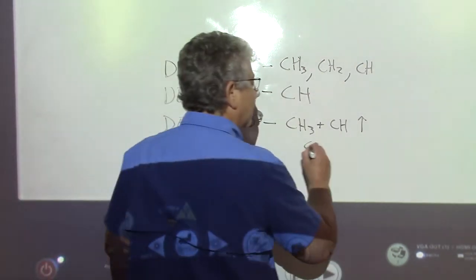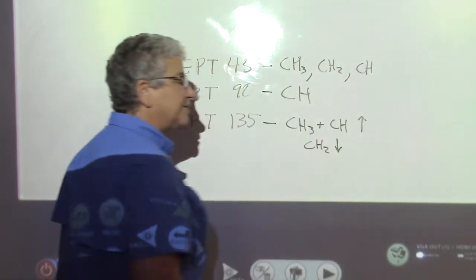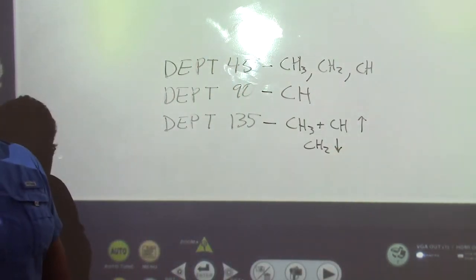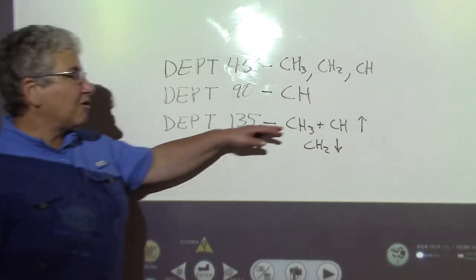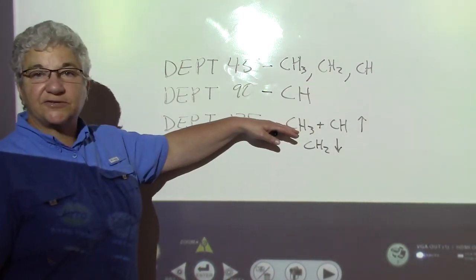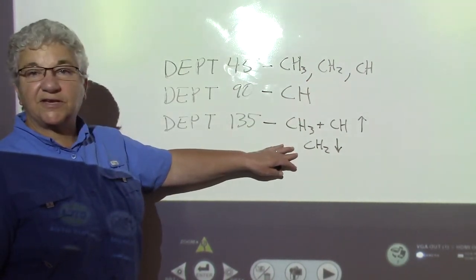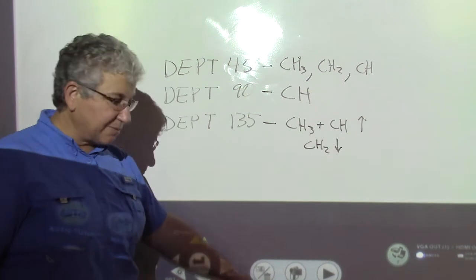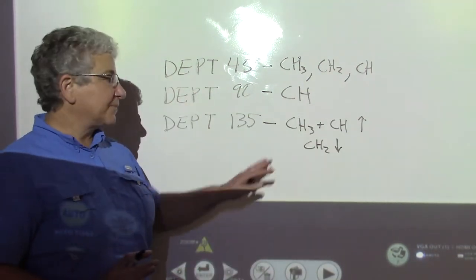And you will see carbons with 2 hydrogens pointed below the axis. So any carbon in your molecule that is a CH or a CH3, that'll be pointed up. Any carbon in your molecule that's a CH2, that has 2 hydrogens on it, that'll be pointed below the axis. Okay? Again, chemical shift the same.